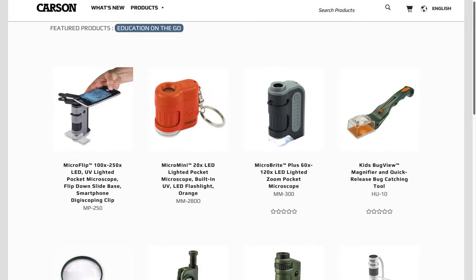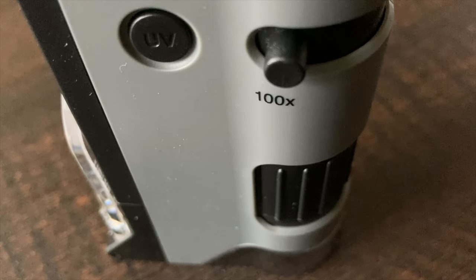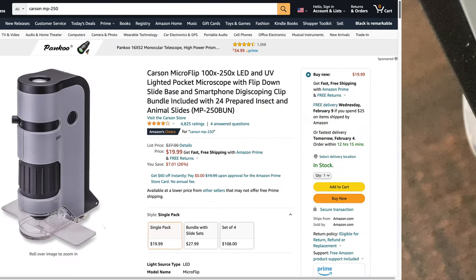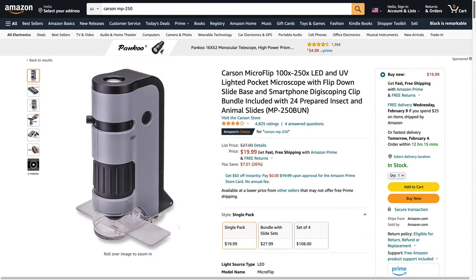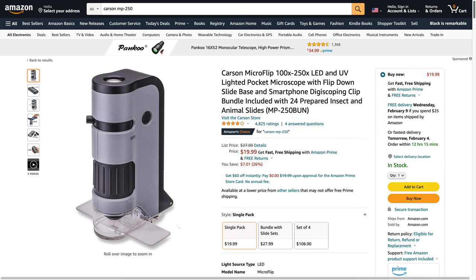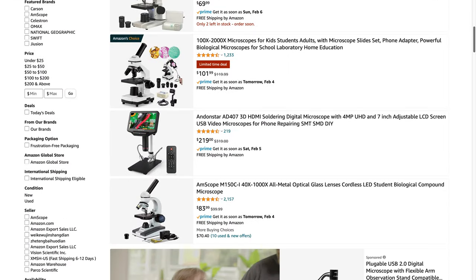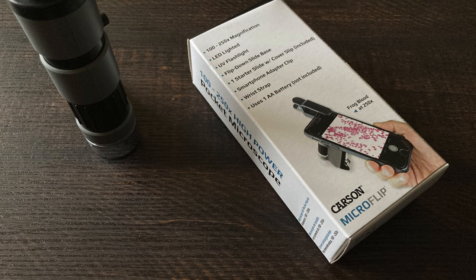This microscope is featured on the Carson website as 'education on the go.' I think that's the most appropriate use of this pocket microscope. It's quite portable and something of an entry-level microscope — perhaps for homeschooling. This was only $20 at Amazon.com. Obviously, there's more expensive gear that can do a much better job, but I tried to save money by going with this inexpensive gadget.